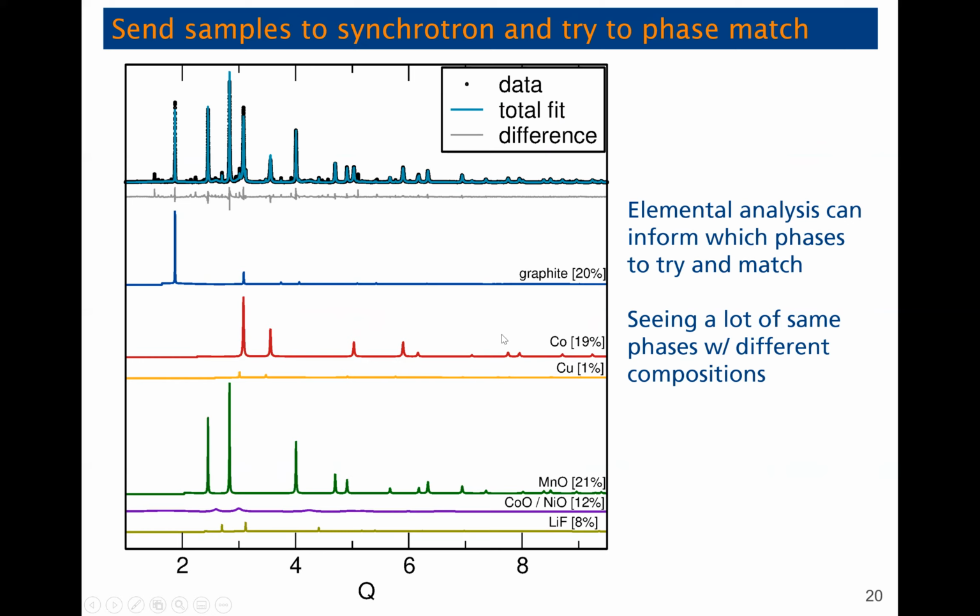Like, we started out with the cobalt in a lithium cobalt oxide, and usually oxides are more stable than the constituent metal. But maybe this whole sample was heated up and it's in the presence of carbon, which is a reducing environment, rather than oxidizing, which would happen in oxygen. So it looks like we had the conditions in the recycling process to get metallic cobalt, which is something they want. We want to be able to get the cobalt out, even though it's all sort of still mushed up into this black powder.